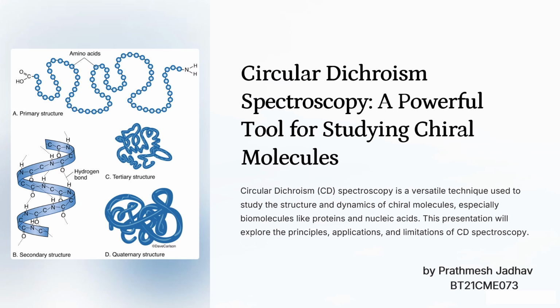Good morning. My name is Prathamesh Jadhav, and today I'll be presenting on the topic circular dichroism spectroscopy, which is a vital analytical technique for studying chiral molecules. Now, this presentation is part of our analytical technique course, and I look forward to discussing this fascinating subject with you.